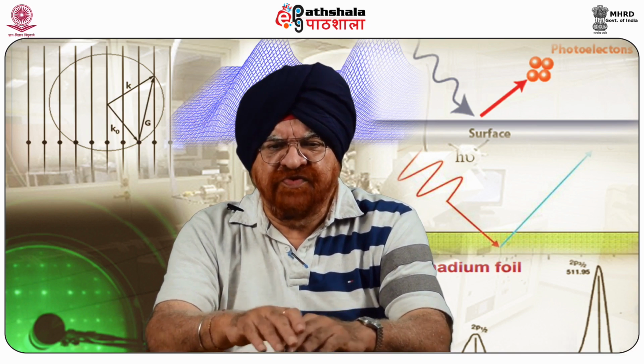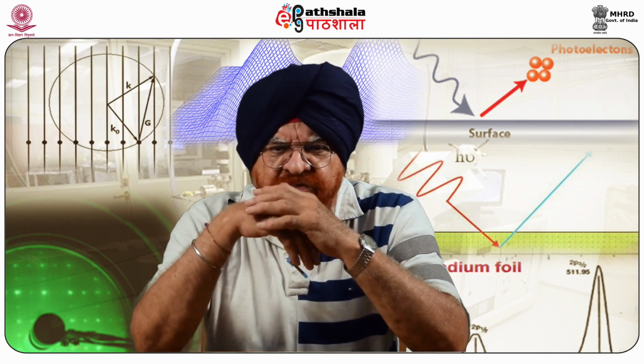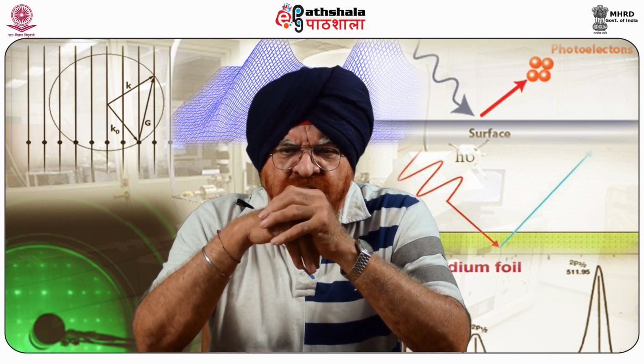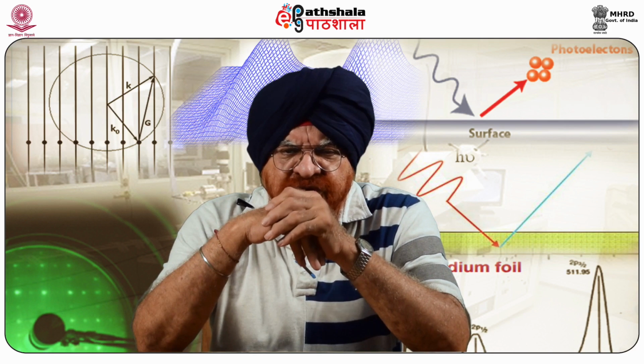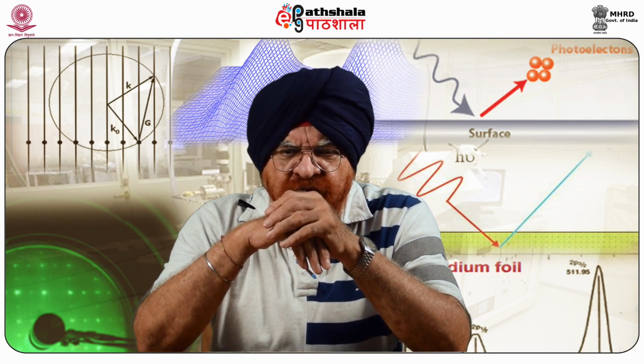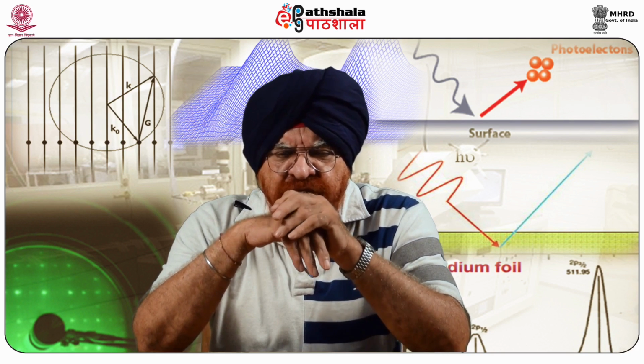Then we come to chemical states and chemical shift of the elements on the surface. The ability to create chemical state information, as distinguished from simply elemental information, from the topmost few nanometers of any surface makes XPS an exclusive and valuable tool to consider the chemistry of any surface, either as received or after physical or chemical treatments.